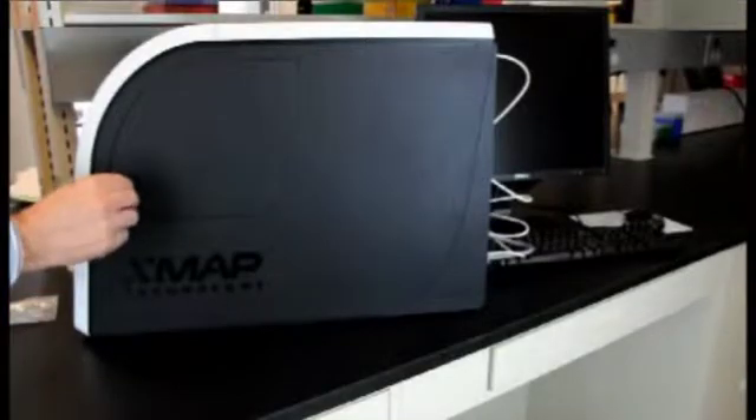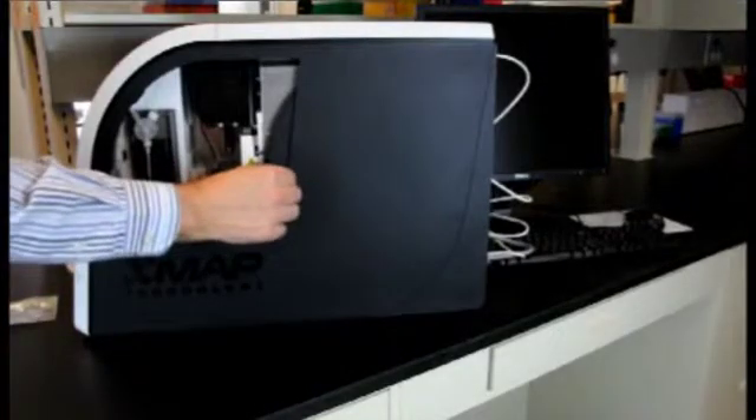Your third step is to insert the tool in the side access panel latch. Turn the tool one-eighth of a turn clockwise and slide the panel to the right.